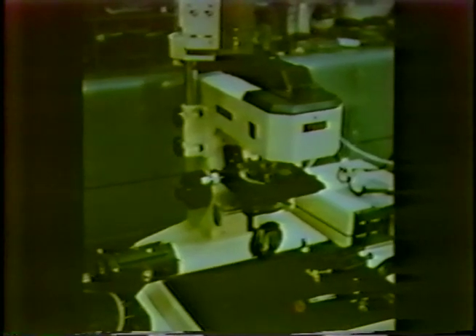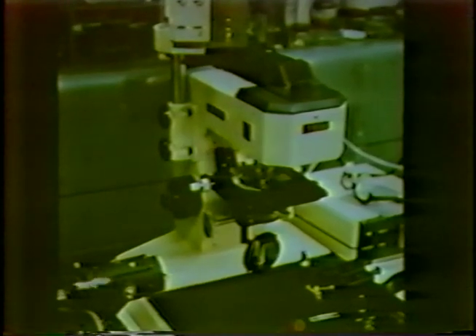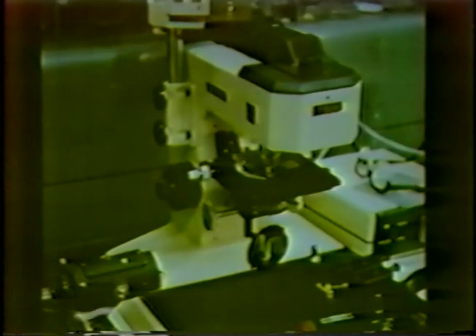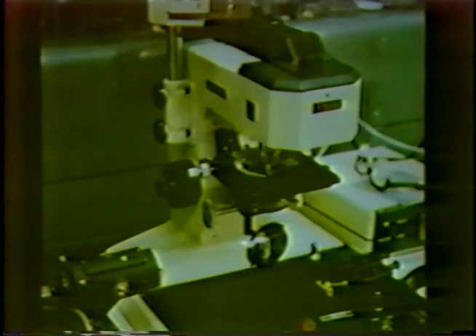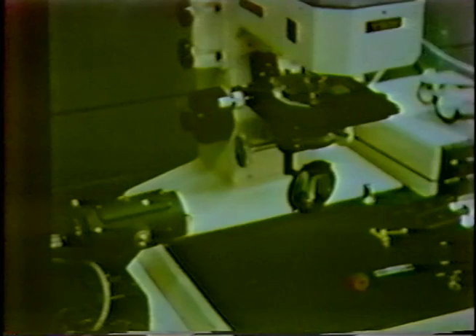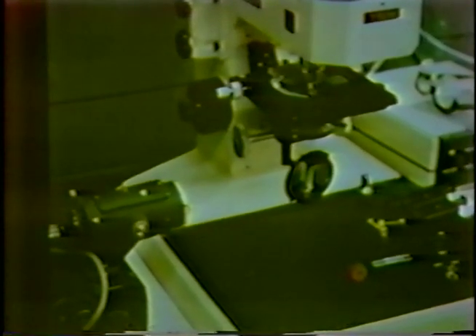Here's another way of getting this cross-correlation, and that is to use an additional source of illumination for the tandem scanning microscope. And this shows an early attempt to do this with the Tracor microscope, an old Watson light microscope lamp and Watson substage condenser bolted onto the microscope, so that we can illuminate here and use virtually any standard method of transmitted light microscopy that you know of to look at the sample in non-confocal mode at the same time as looking at it in confocal fluorescence or reflection mode.